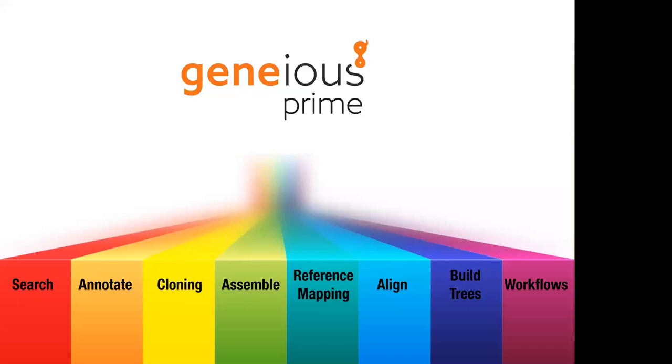You can also do alignment, so pairwise or multiple sequence alignment, either with DNA or protein sequences, as well as building phylogenetic trees. And that's, in fact, the space that Geneious started out in something like 15, 20 years ago at this point, started out in that alignment and tree building space.